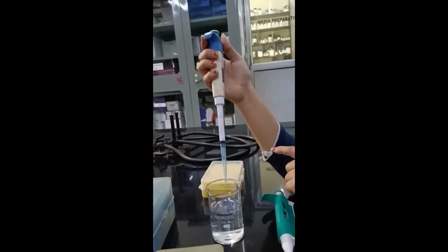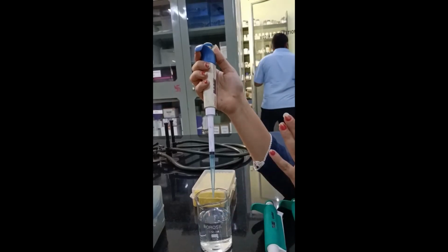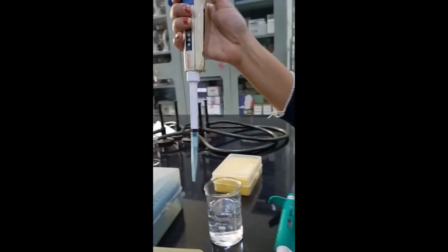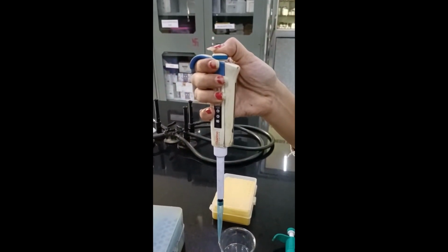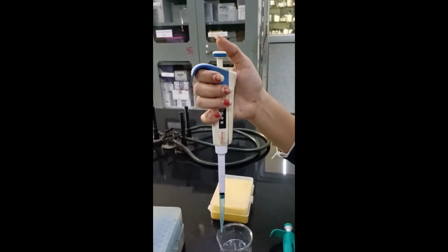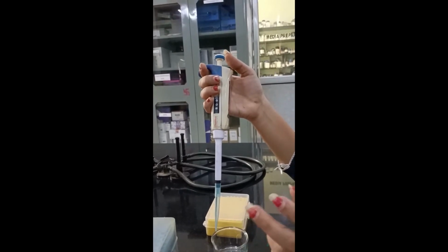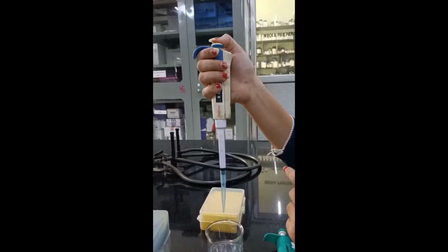For aspirating the volume of a fluid from the given sample, you have to hold the micropipette upright at a 90 degree position. Now there are two presses. One is the single press, and followed by that there is one more press, the second, which is the double press. Always apply a single press to aspirate a volume. If you apply a double press, it is going to take up a volume higher than your required one. So always apply a single press.